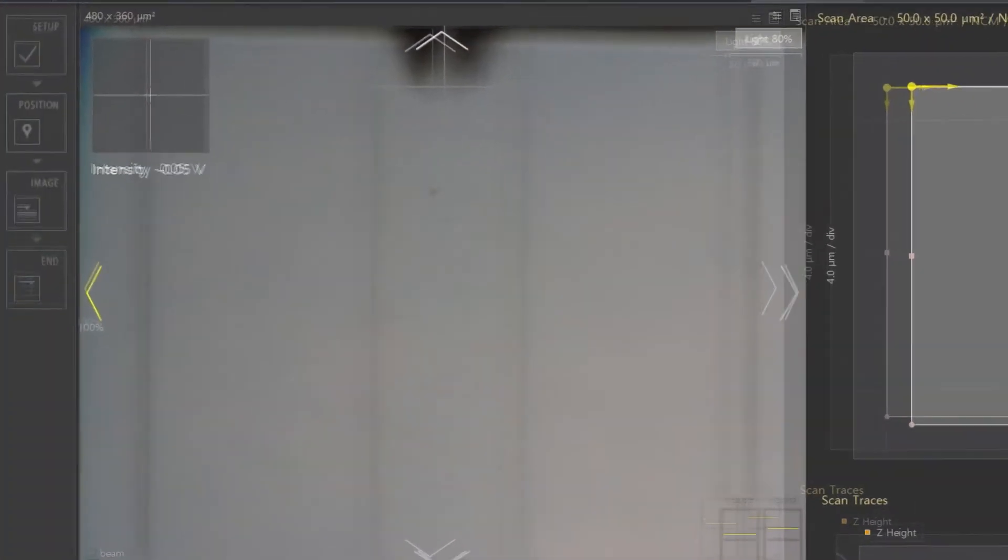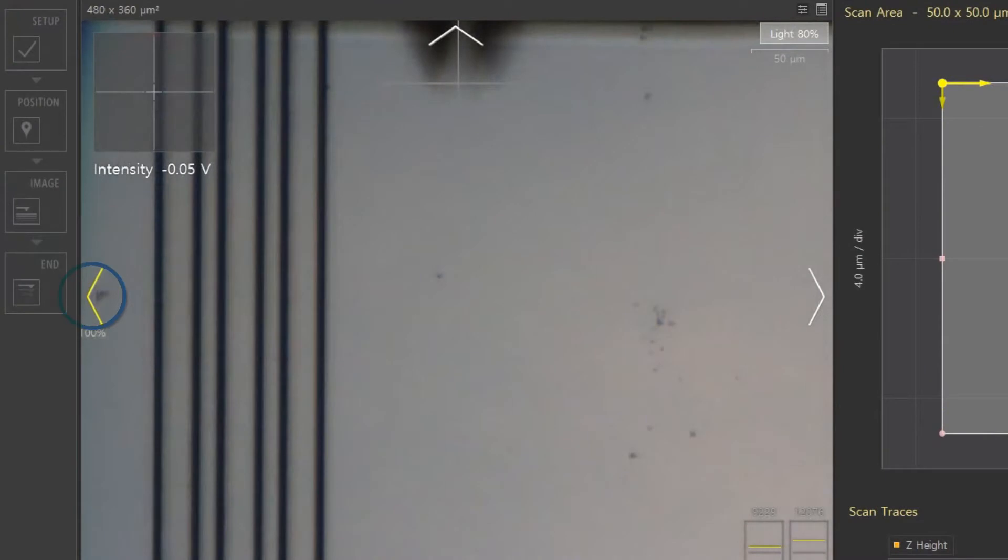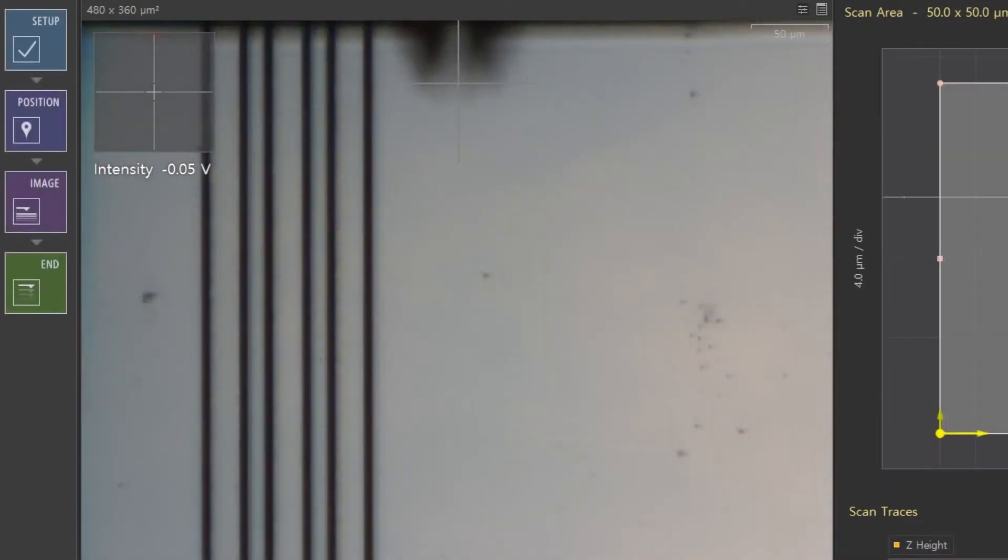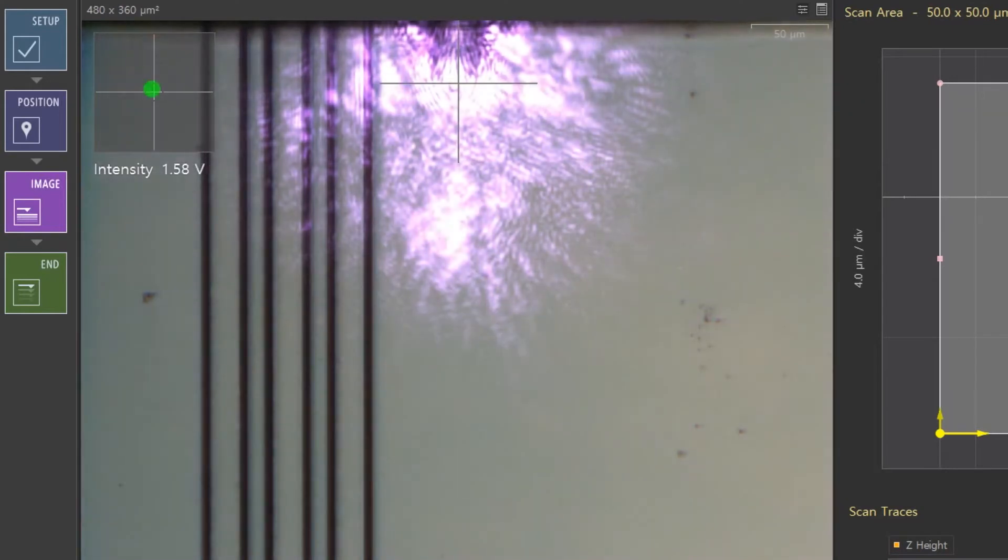With your mouse in the optical feed display of the sample, you can quickly move around to other regions of interest by simply clicking on the directional buttons near the display's edges.